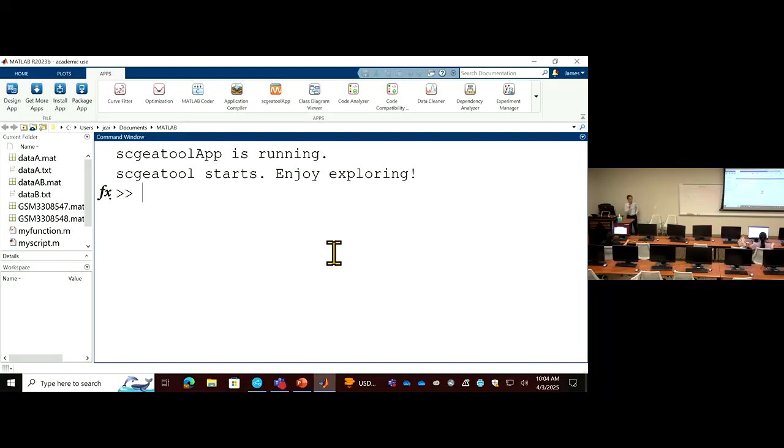Okay, just go around and make sure you have this updated version installed. Then we can start today's program.